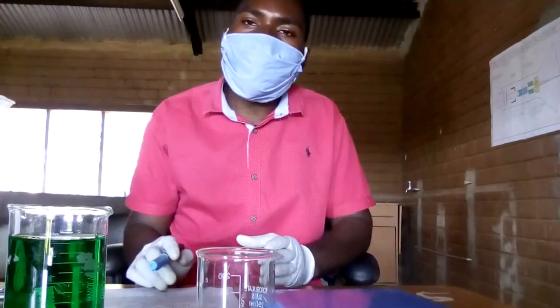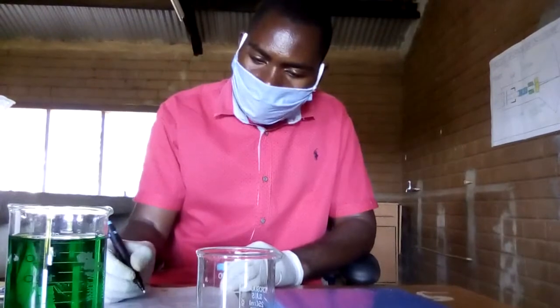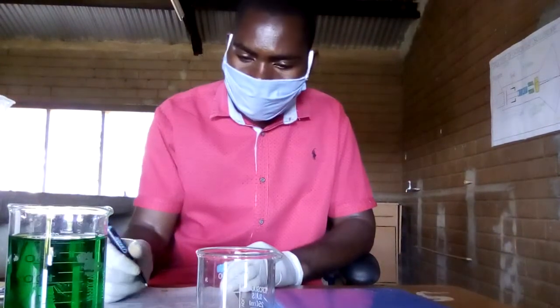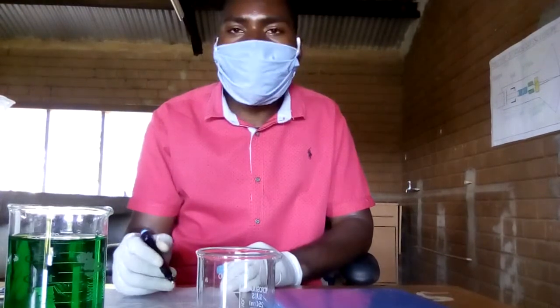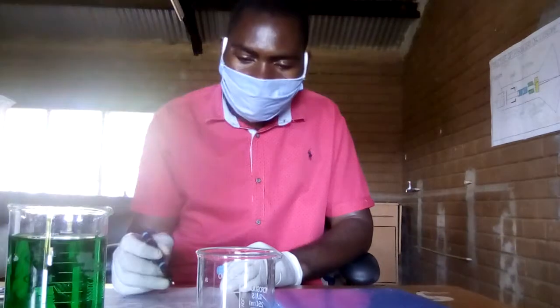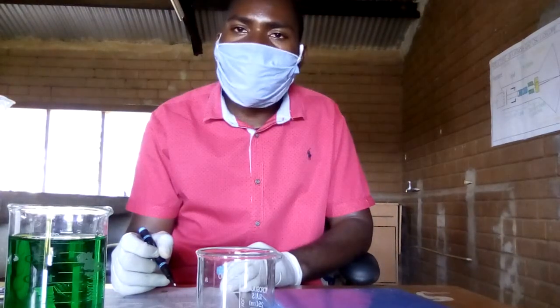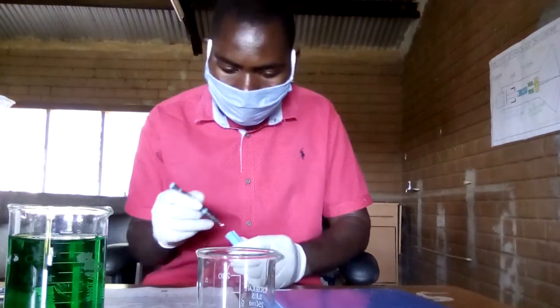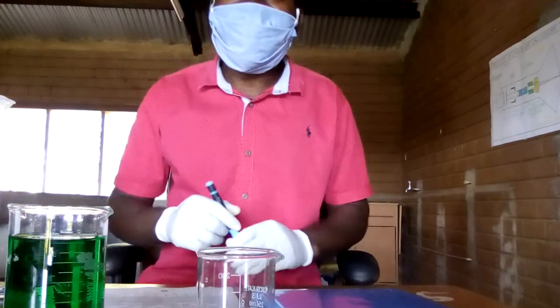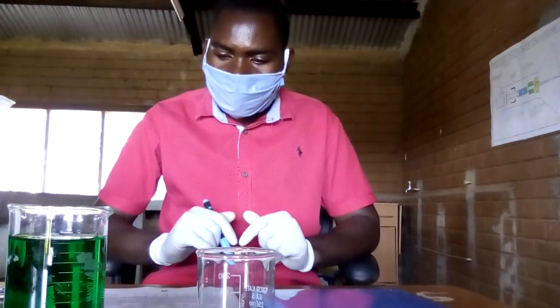With the formula you're going to use, you say mass is equal to mass 2, which is M2 minus M1. Once you substitute the figures, the answer you should get is 11.3 grams.